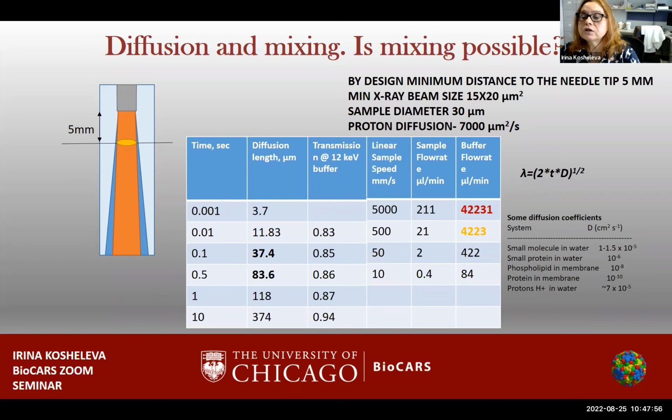And the diffusion length I calculated for the protons for different times, and with our beam compatible only maybe 50-100 millisecond time delays. Everything smaller than that, we will have a very narrow stream within a very wide buffer background, which is basically difficult to measure.